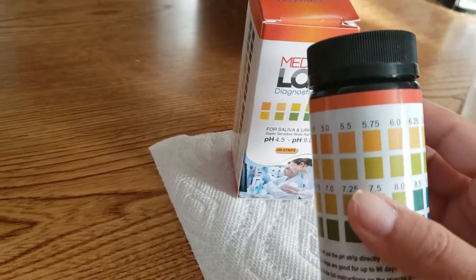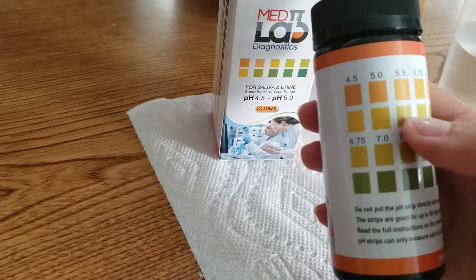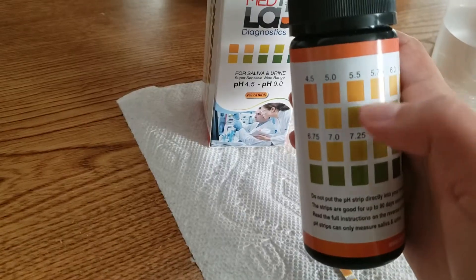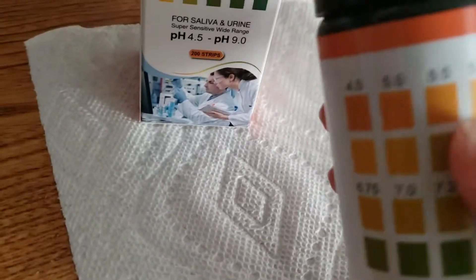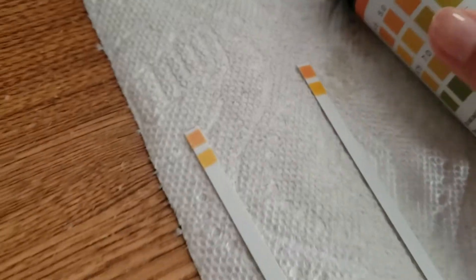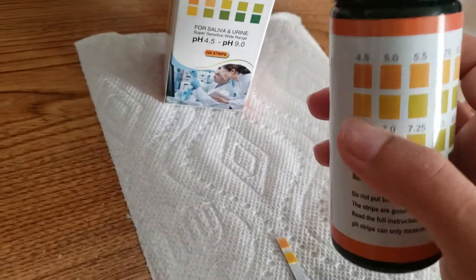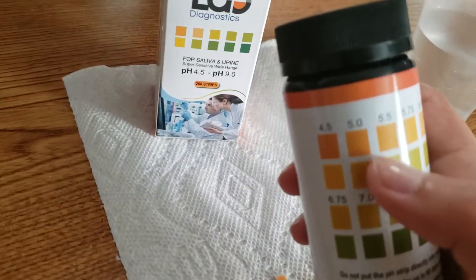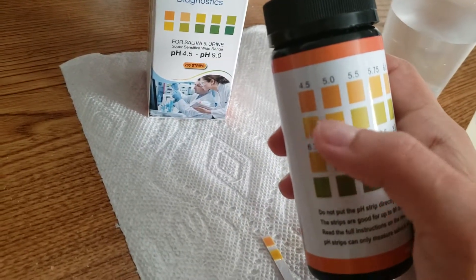When you look at the results, the two pads are going to be read as one result. The two colors underneath each result correspond to one result, and the two color pads on the bottle correspond to the two color pads on your strip. So when you compare your strip, you want to compare the two pads on the strip to the two pads on the bottle that match the closest.